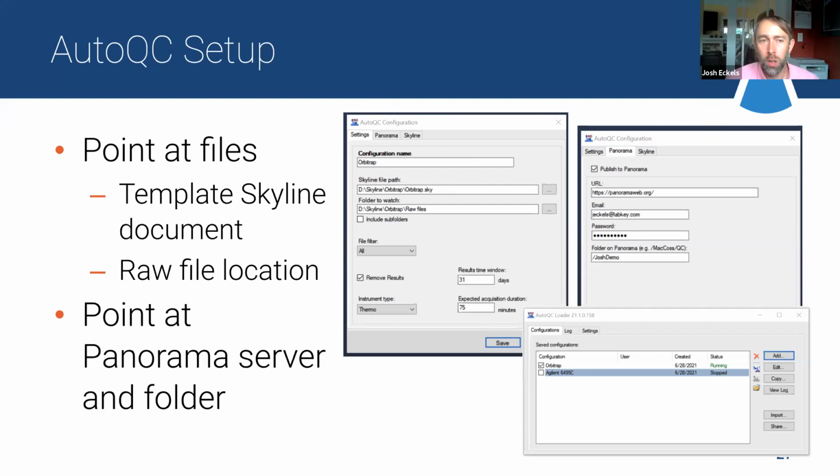That is definitely something we're thinking about, and we'd love to hear more examples of how to pair those, which ones are compelling to look at together, to pre-configure that, or that is something that can be set up. We can do paired metrics, split Y scales in that customization. So that's one of those premium features that I mentioned, that you have access to on Panorama Web.